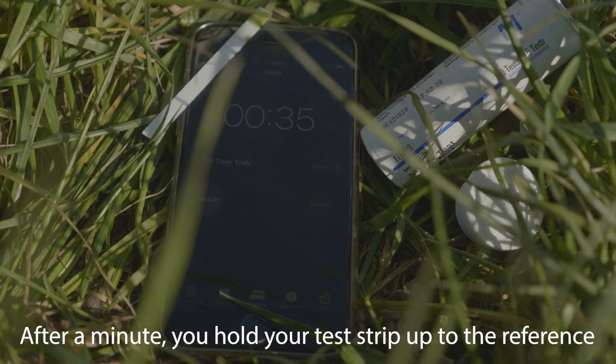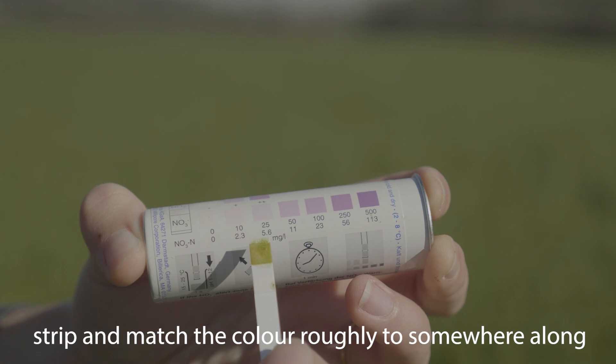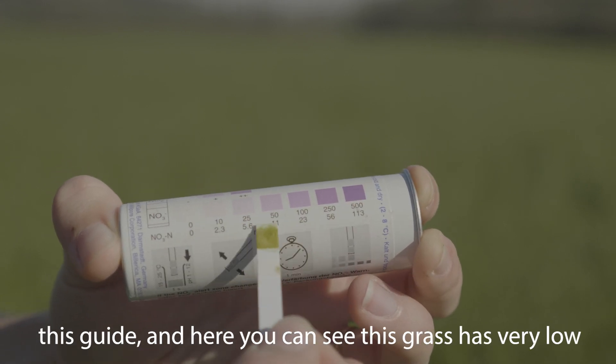After a minute, you hold the test strip up to the reference strip and match the color roughly to somewhere along this guide.